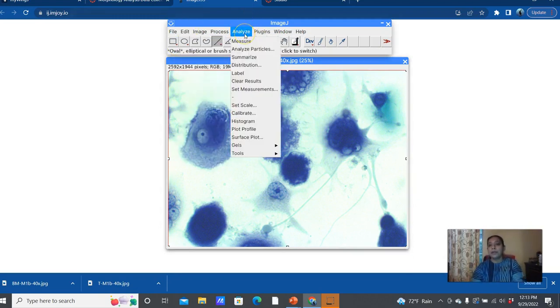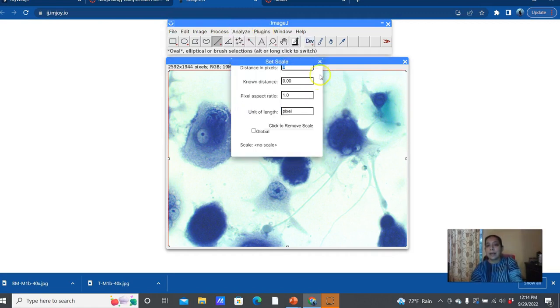So if you were using the front microscope and you know your calibration already, you could go to Analyze and Set Scale and go ahead and set that calibration. I believe it was 2.4 maybe. I am making this up, so please do not take that. You would need to look it up in your actual sheet from Microscopy Workshop and see what it is.